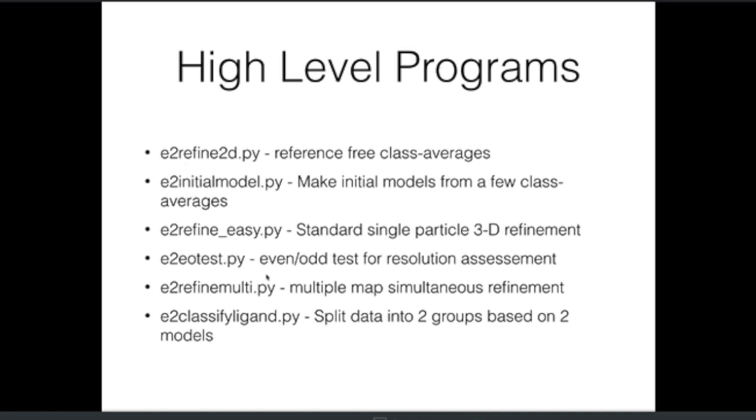And if you want any details on any of this, we have a number of very nice tutorials available on the website which can take you through the entire system. We have a nice tutorial which will get you to a sub-nanometer resolution reconstruction from a set of sample data that we provide. Basically, you can do it in an afternoon on a laptop.